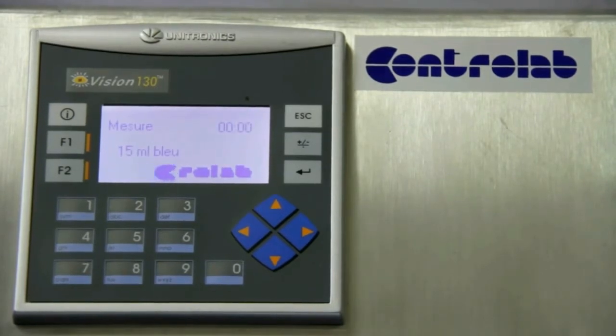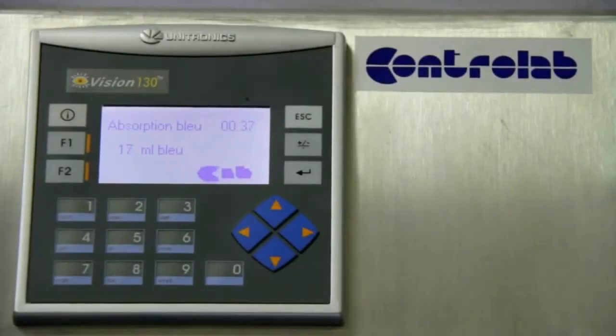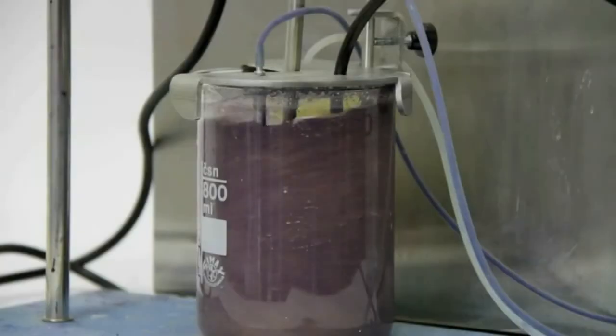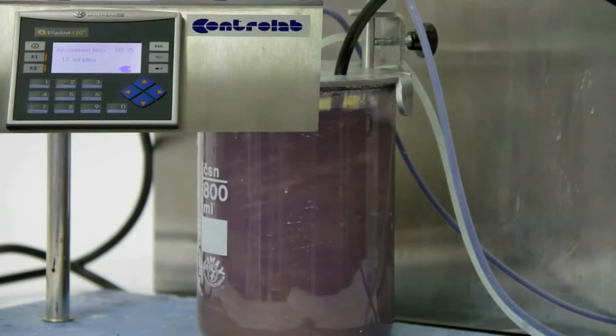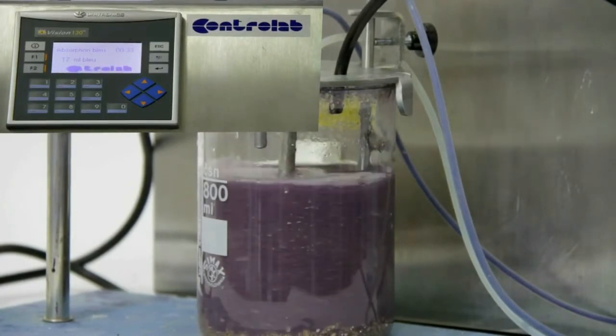According to the result of the analysis, the machine adds or does not add a certain amount of blue and repeats the stirring process. Then it starts with sedimentation and the analysis of the amount not absorbed by clays that are present in the sample.